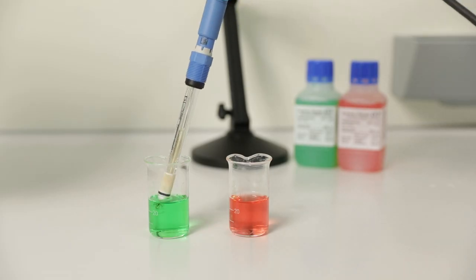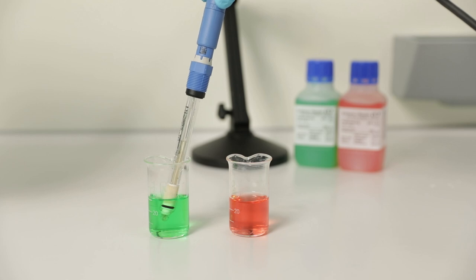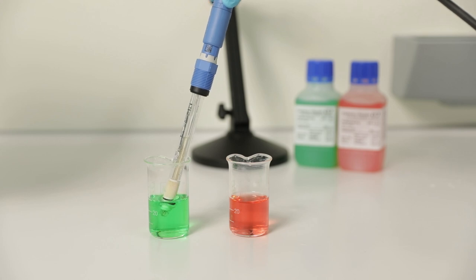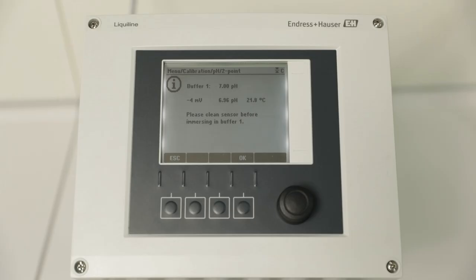Put the sensor in the first buffer solution requested from the CM44, by default pH 7. Wait around one minute to let the sensor settle. Confirm with OK.